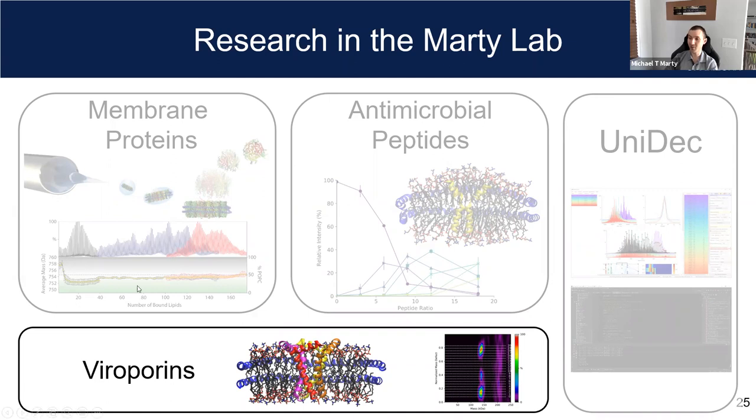One of the things I didn't put in here because it's still very early is we've actually done this now with E. coli lipids. And so Frank will appreciate we're doing charge detection to verify that we're getting good nanodiscs. And we can actually use CDMS with the Orbitrap and see a beautiful intact nanodisc. But you can't resolve any of the lipids until you start breaking it apart. But when you break it apart, we get really nice peaks of some very specific lipid bound. But we've got to figure out what that lipid is.